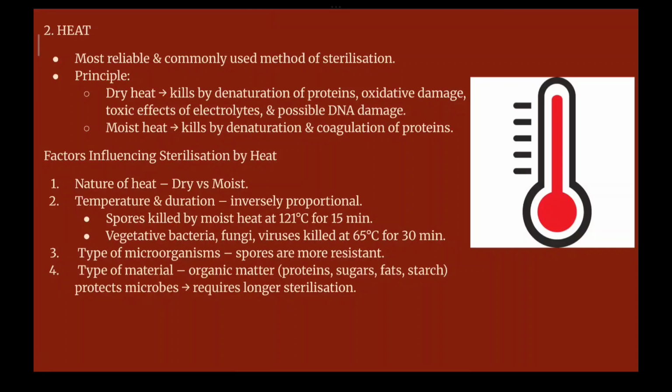So the principle that is being used for dry heat and moist heat sterilization is here. In dry heat, it kills by denaturation of the protein, oxidative damage, toxic effects of electrolytes, and possible DNA damage. So what does this tell? Now, kills by denaturation of protein.